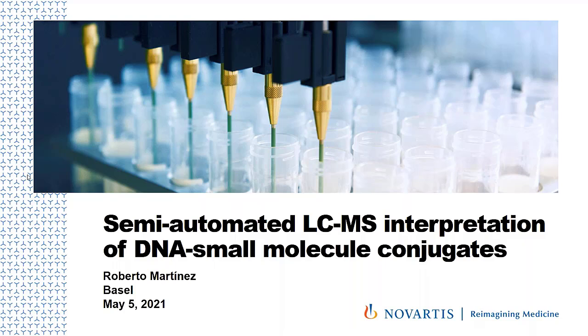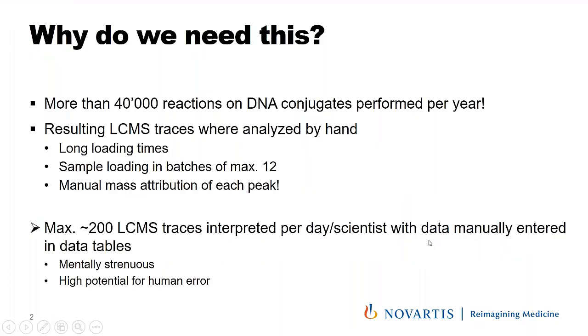But first of all, why do we need this? In our lab, with around 6 lab associates, we analyze more than 40,000 LCMS traces per year. Historically, we used to interpret them one by one using the built-in software of our TOF.